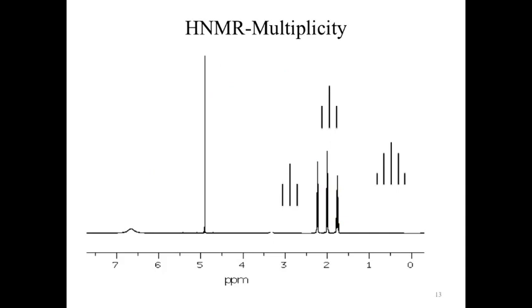Okay? One more quick note before we skip off from this is that you'll notice that when we mark these, okay, remember everything is supposed to be symmetrical. You'll notice these aren't perfectly symmetrical. If we connect our red lines, they're angled that direction. Same deal with our purple lines. They're angled towards our right. Okay, seems a bit odd. What about that last one? Where is that angled? That's actually angled back towards the left.